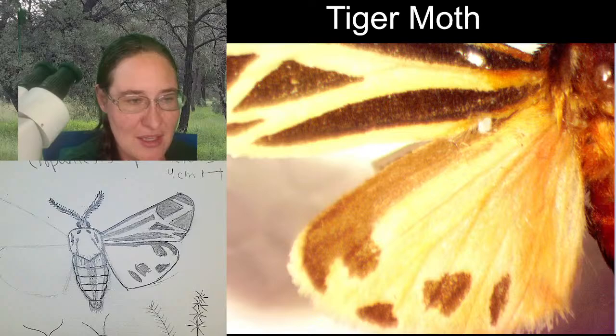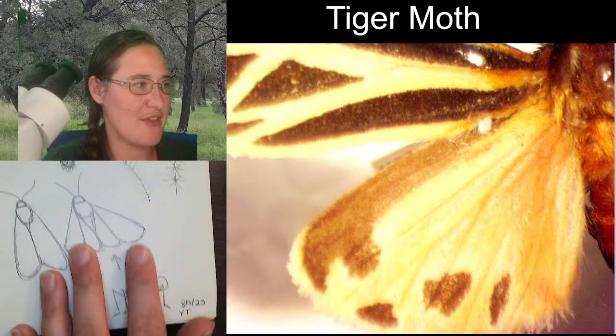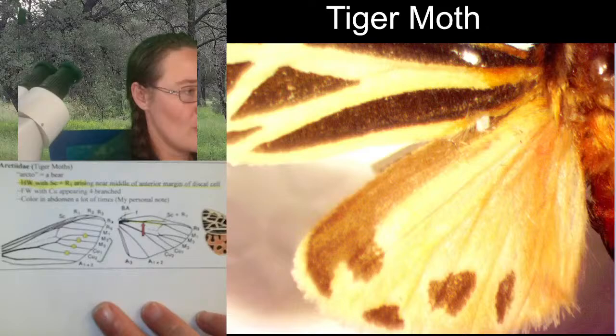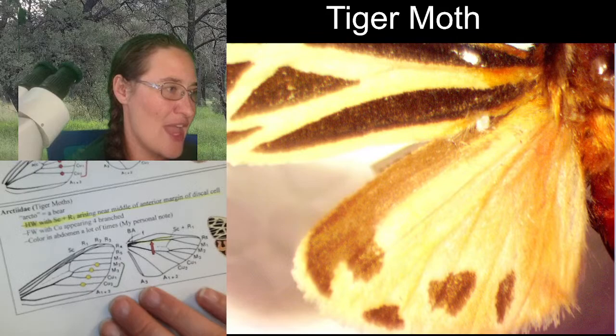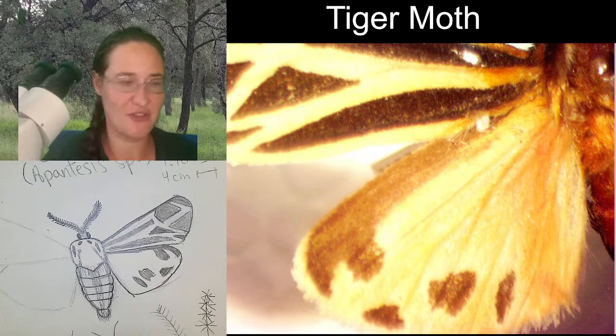So I'm glad that we got to talk a little bit about legs and about how they sit with their wings and really get a detailed sketch of the coloration. You know, if you wanted, this is going to be the wing venation of this specimen. There might be small changes in it, but this is what it's going to look like for most Arctiids. Wing venation in butterflies and moths is a family characteristic. So to get past family, you have to use other characteristics, but that's going to be what you use here. So that's a little fun factoid.